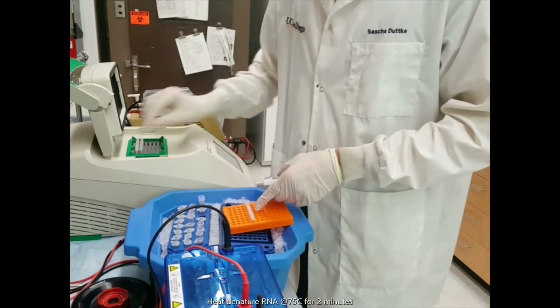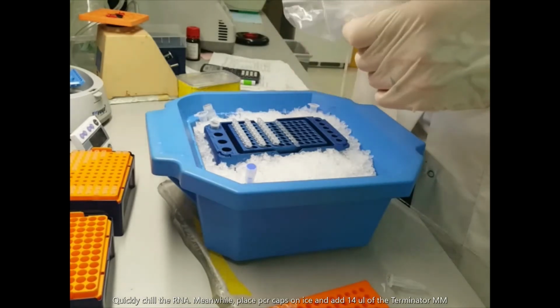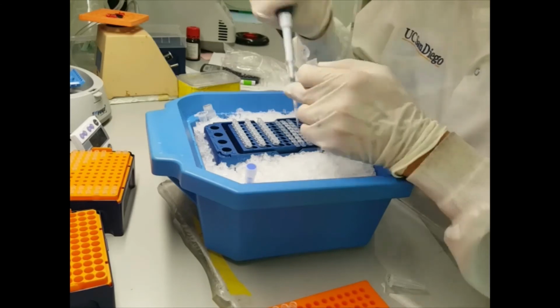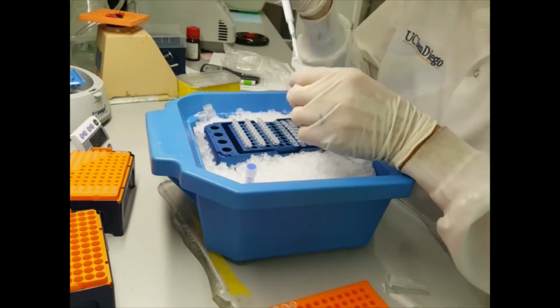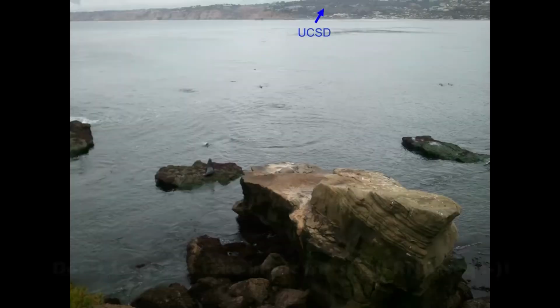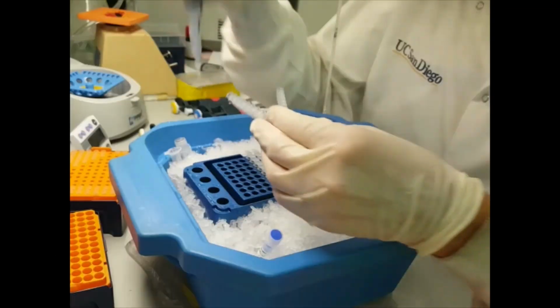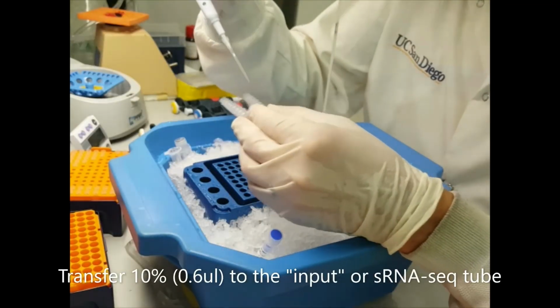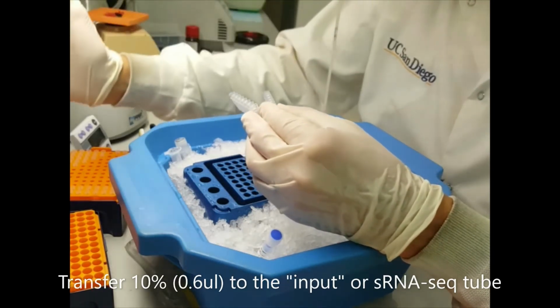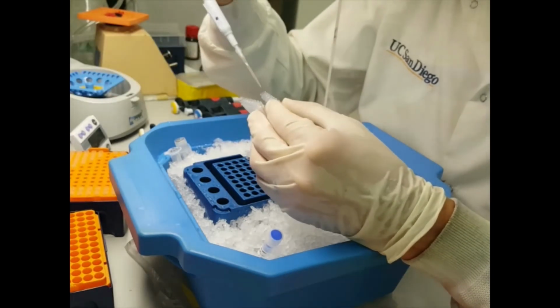Next, heat denature the RNA as shown earlier using a PCR machine for 2 minutes at 75 degrees and quickly chill on ice. While cooling down, you can add 14 microliters of terminator master mix into 3 sets of PCR lids. Next, it's important to not forget the input. Therefore, quick spin the PCR tubes, remove the caps and transfer 10% or 0.6 microliters of the small RNA mixture into the input PCR strip tubes that contain the TET.